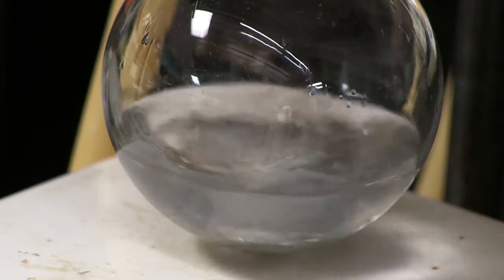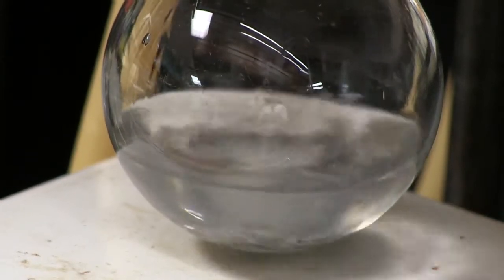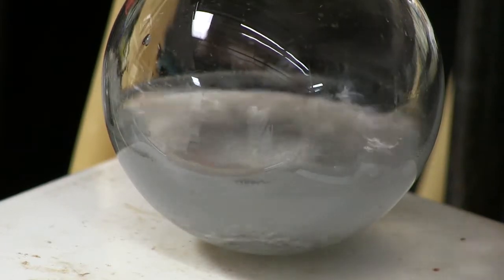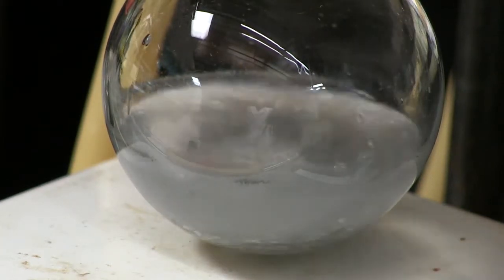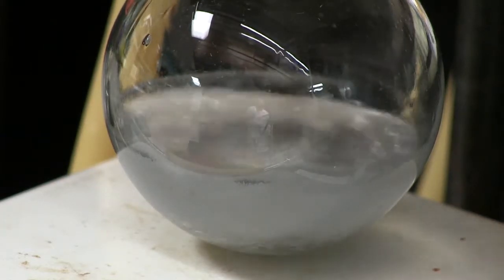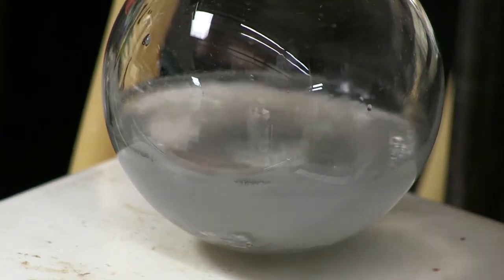If the reaction does not start within 3 to 5 minutes of addition of the second portion, add a crystal or two of iodine directly to the pot. Warm the solution slightly by turning the heating mantle to its lowest setting. Once the reaction has started, gently heat the pot. The ether solution should be gently refluxing.